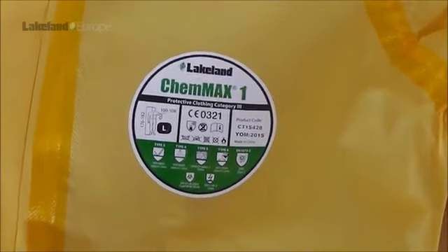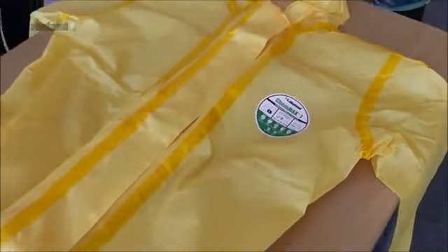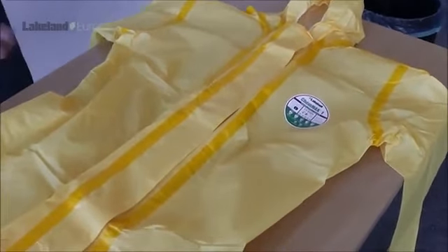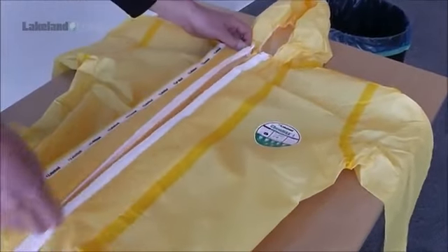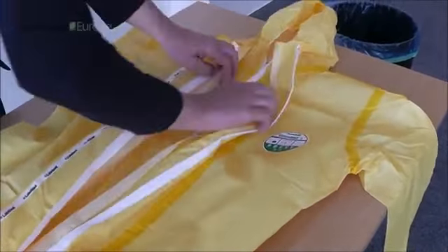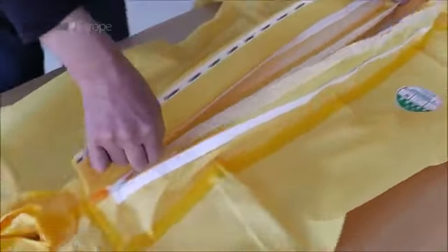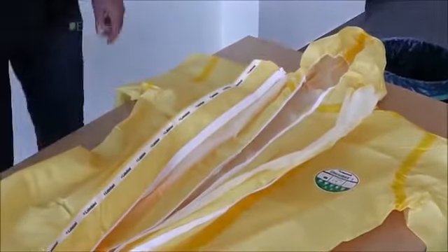All Lakeland CE certified garment chest labels feature the required CE information for easy visual reference. For superior safety, Lakeland Chemmax garments feature a double zip and storm flap front fastening. This ensures a good seal is maintained at the front. Unzip the front fastening by carefully pulling down the outer zip fully and then repeat with the inner zip. You are now ready to begin donning.